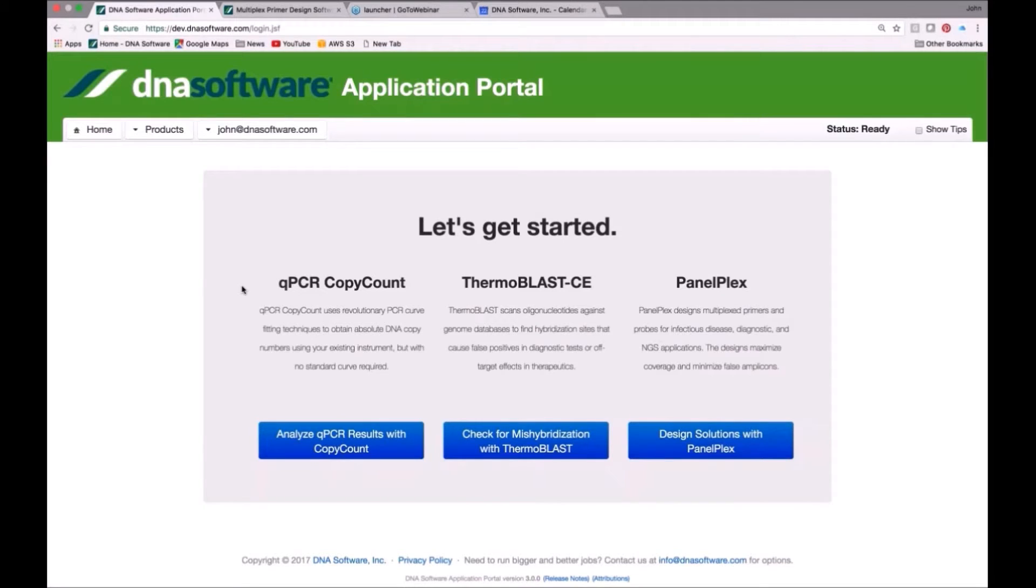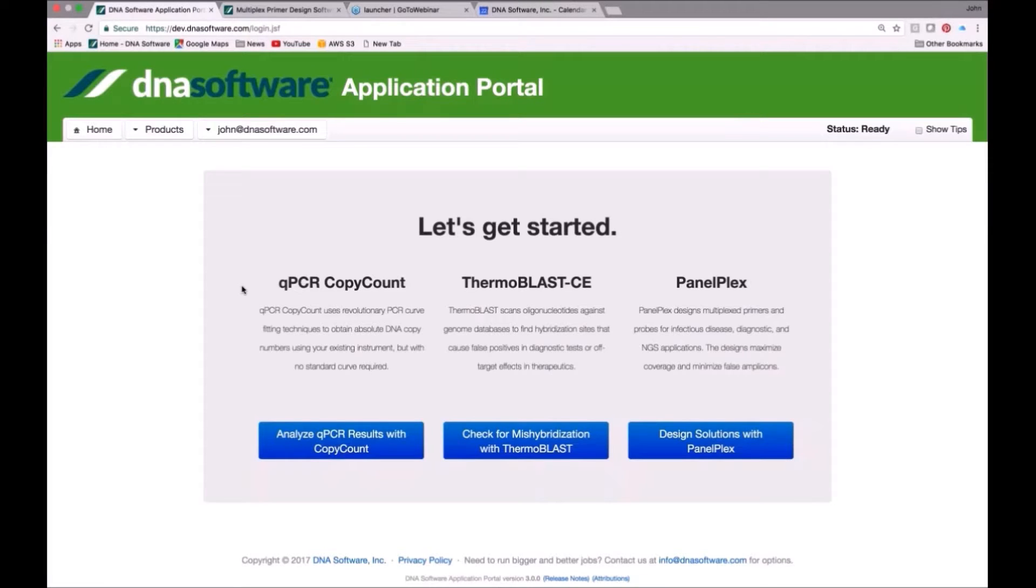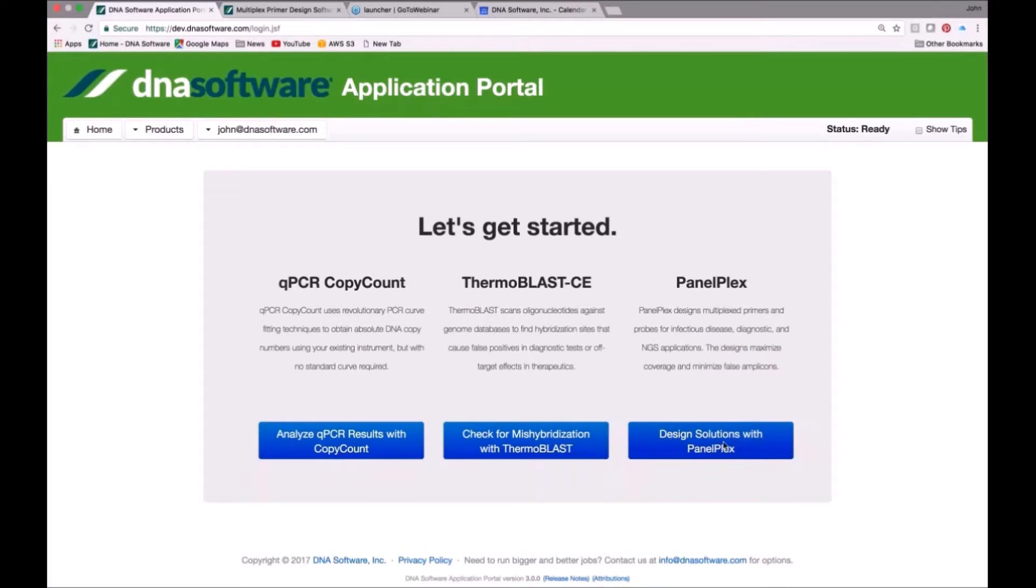qPCR copy count, which is for analysis of PCR to get absolute quantification, Thermoblast, which is a standalone product for checking primers you may already have at your organization, and PanelPlex, which is what I'm talking about today.